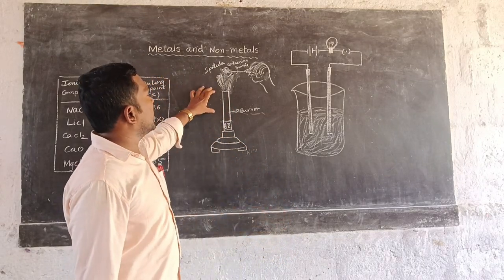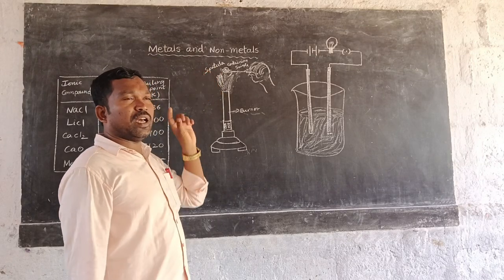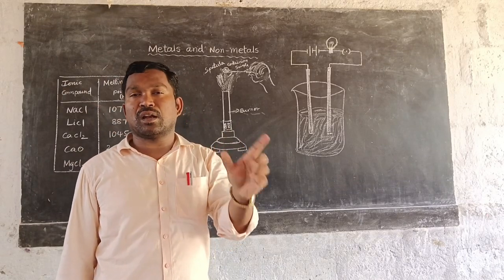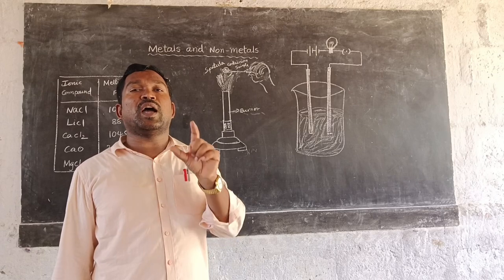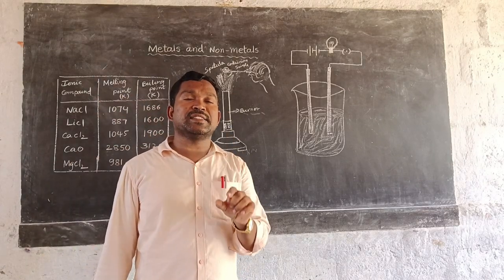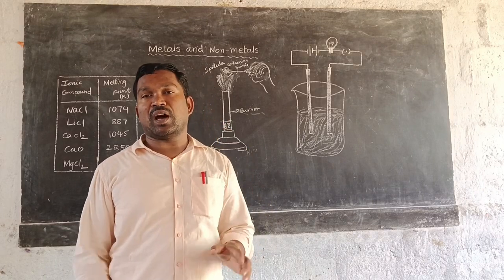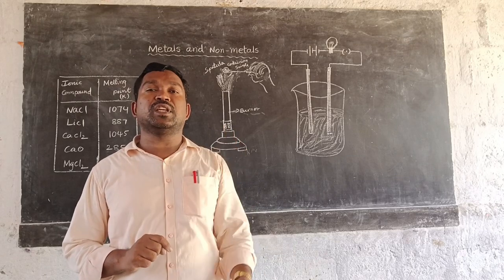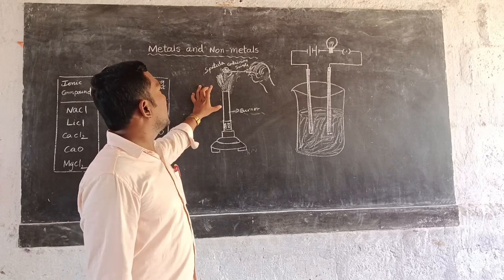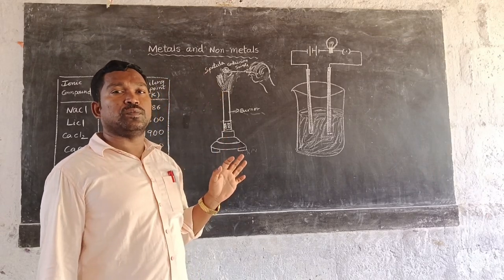burn it with the help of a Bunsen burner. Directly burn the salt. Here we observe whether the ionic salt melts or not, and also the collected samples. What is the state of the ionic salt after burning? After burning, observe whether the ionic salts melt or not.